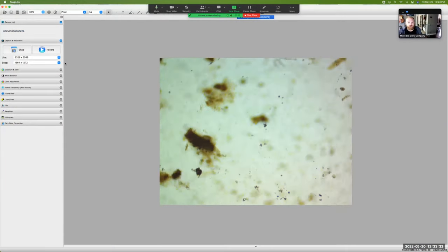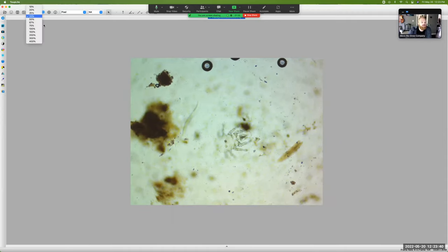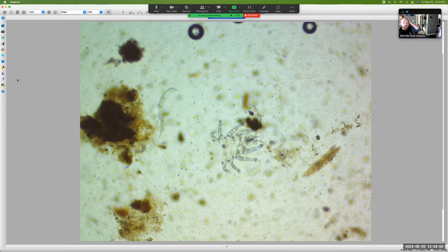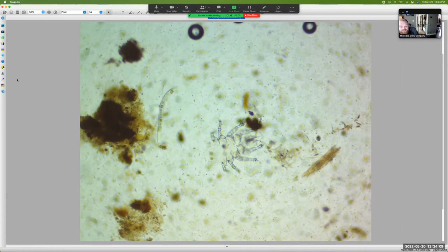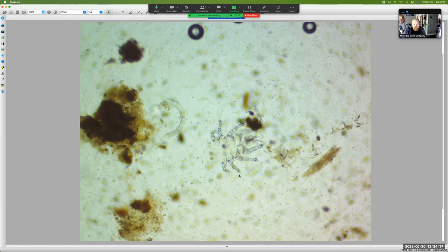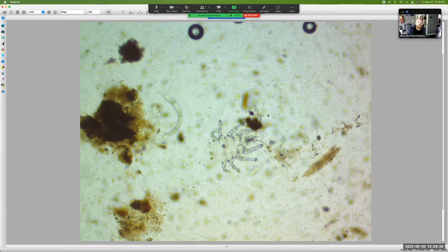Right away we saw a nematode action happening right off the bat, which is nice. You see how I was talking about the soil suspension — the solution and the suspension. Wow, look at that — there's like a microarthropod body right there. It's not alive anymore but you can really see its whole body right here. It's like a soil mite, could be like Hypoaspis miles or something.